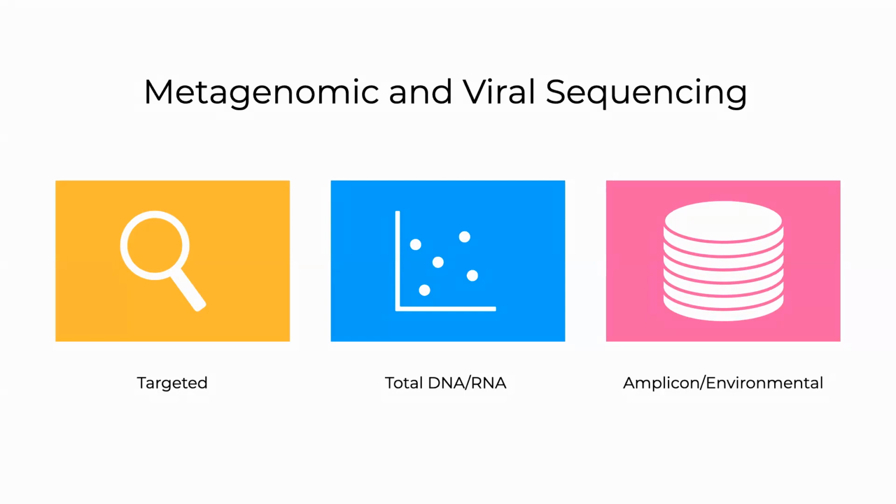There's also a possibility of detecting novel viruses in total DNA or RNA of the host. So if we don't do any kind of depletion of that DNA or RNA, we're able to detect presence or even sometimes quantify how much viral DNA or RNA might be present. And there's a lot of challenges associated with doing that to really differentiate between what is and what is not a true viral RNA or DNA.